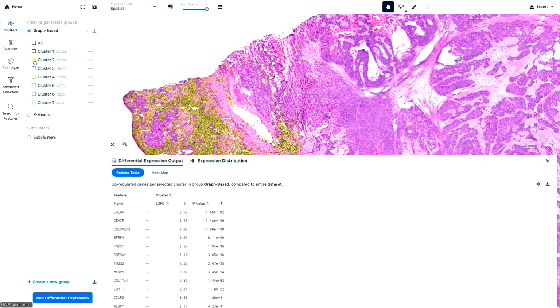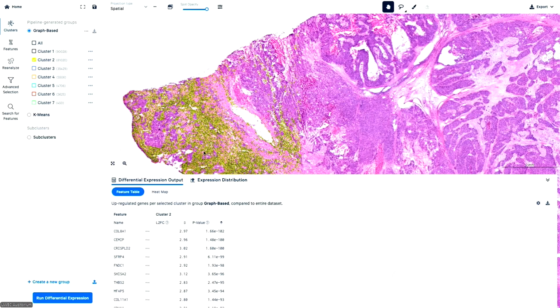If we look at cluster number 2, which is this one here in green, it accounts for 30% of the barcodes that we detected. So I think there could be more heterogeneity. And so here we can use a functionality in Loupe Browser, which is called Reanalyze, to tell the software to search for more heterogeneity.